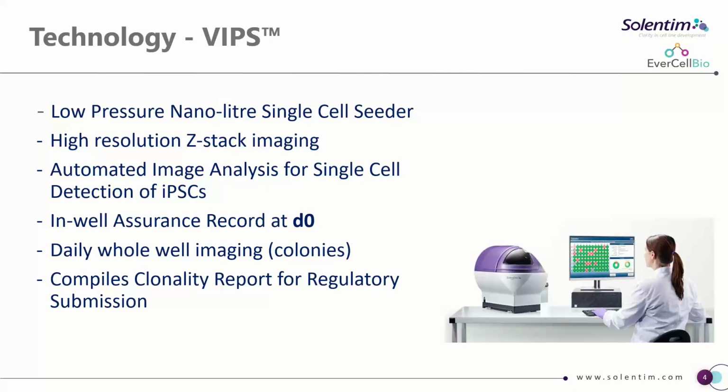So one of the key things we've done as we've moved from CHO cells is we've actually trained the VIPS with libraries of iPSC cells so that it can specifically recognize these types of cells in the droplet and use that intelligence.